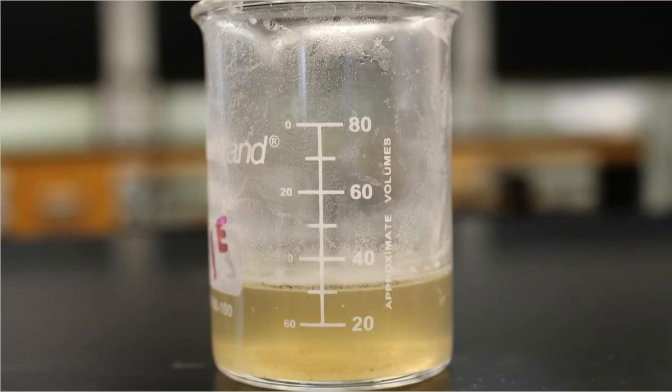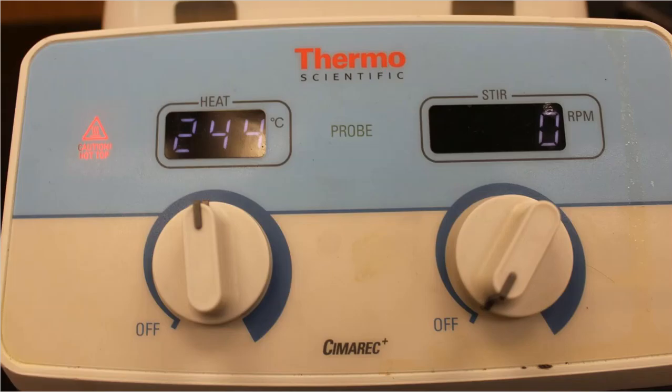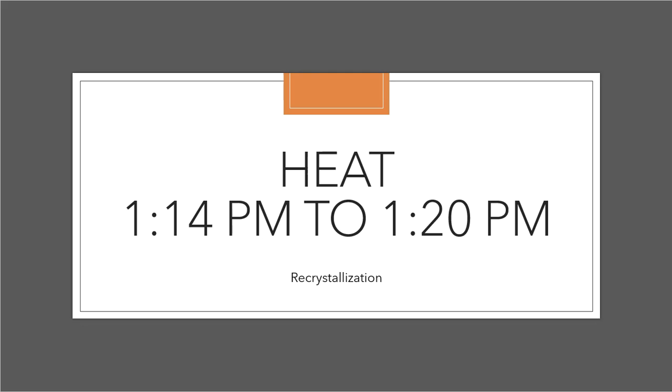All right, so the setting on my hot plate for the recrystallization was here. I set it about halfway up. The reading on the hot plate was 244, but you really probably just need to say I turned the knob halfway. And that heating process happened from 1:14 p.m. on that day to 1:20 p.m. Notice it didn't take very long at all.